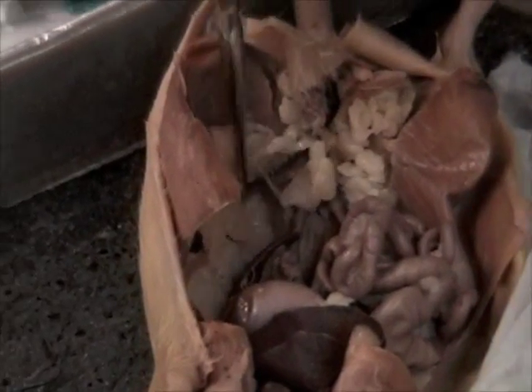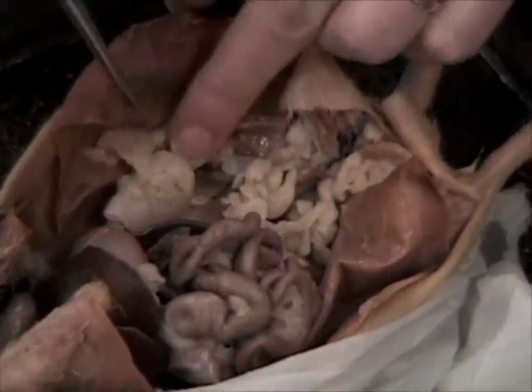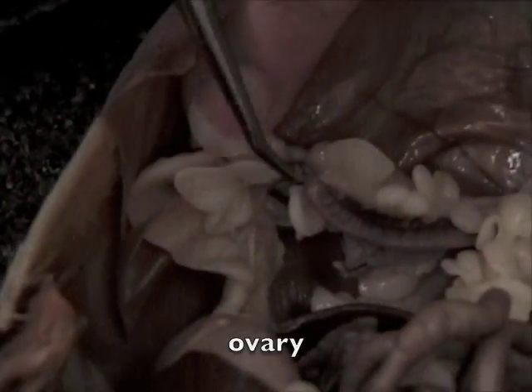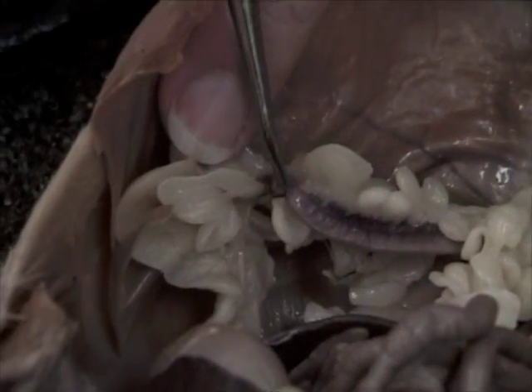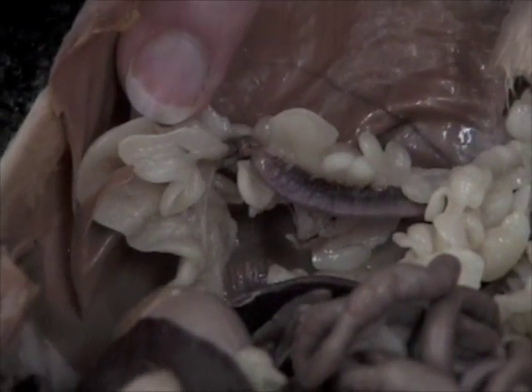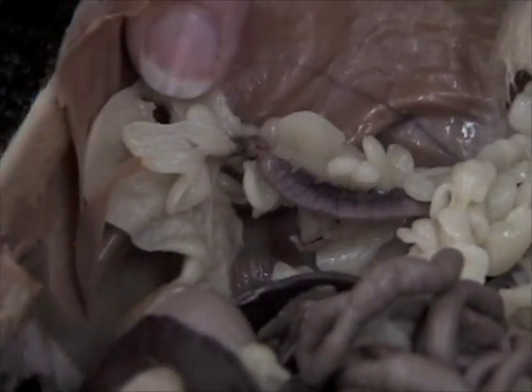Now the ovary. The ovary is this guy right here. The sphincter-like area right there is the oviduct or fallopian tubule. So this is quite different from what it is in human females.